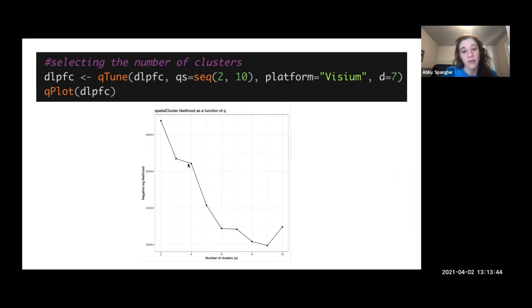And they say you want to choose a Q in the elbow of the plot, which can be kind of hard to determine because some of these plots look a little bit weird. But I just did this for good measure because we know already with DLPFC data that we're looking for approximately seven clusters because we have the six layers and the white matter. But in the future when we're working on tissues that we don't really know the structure of, we would probably want to use this to advise the number of clusters that we want to use.